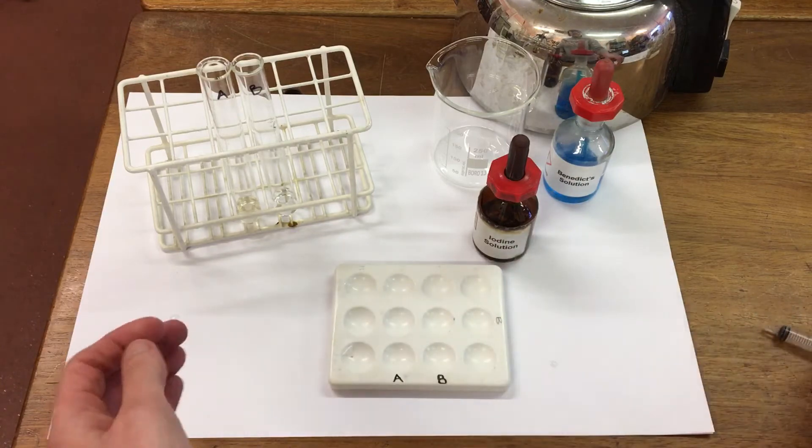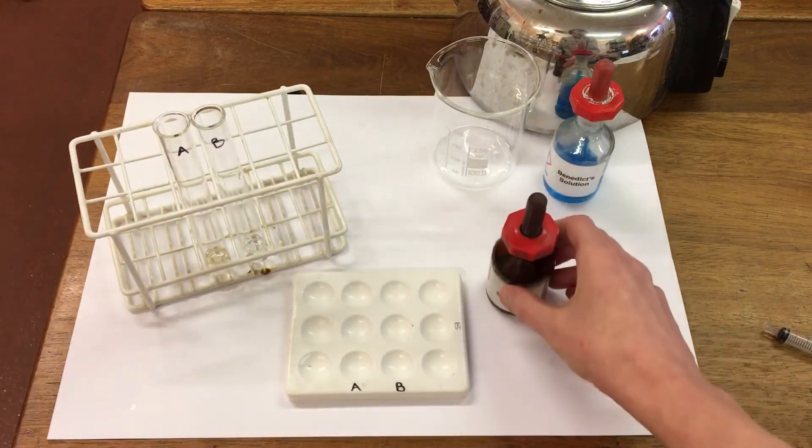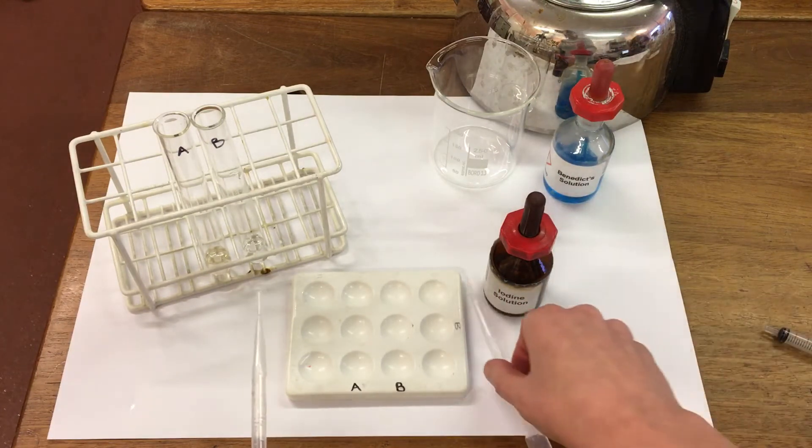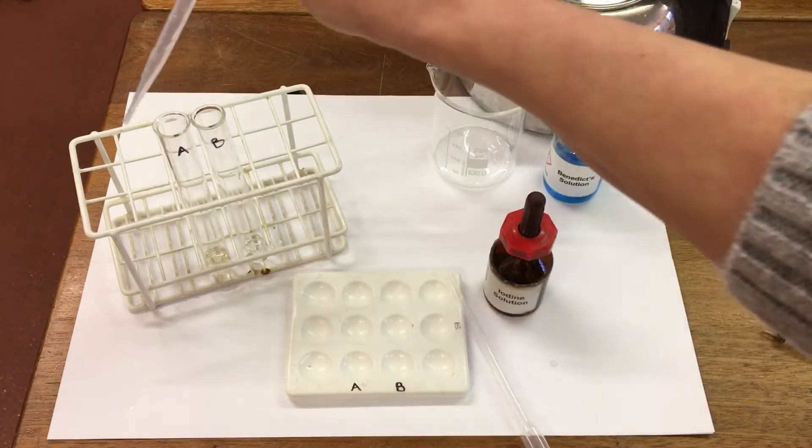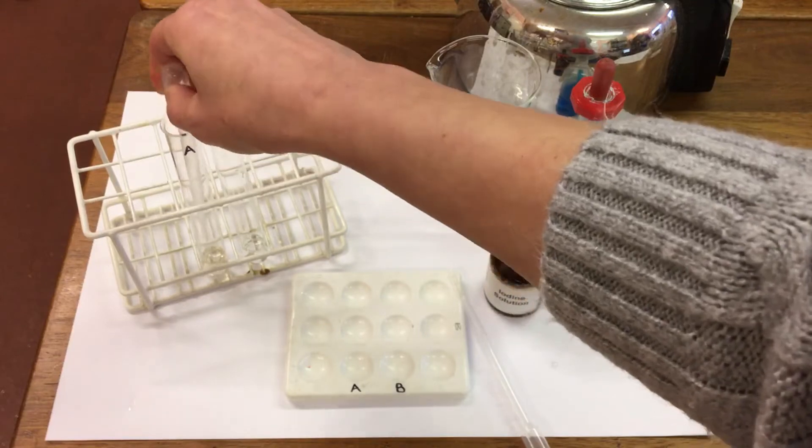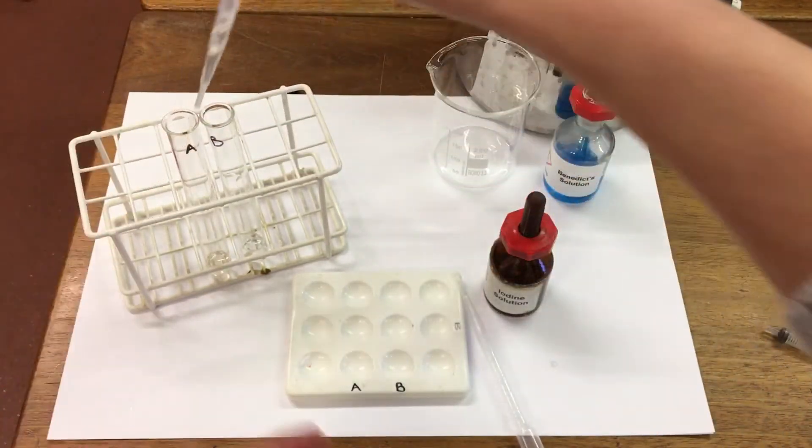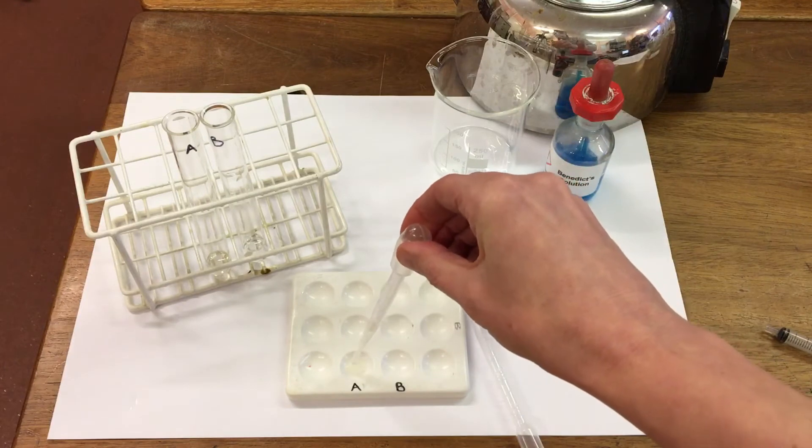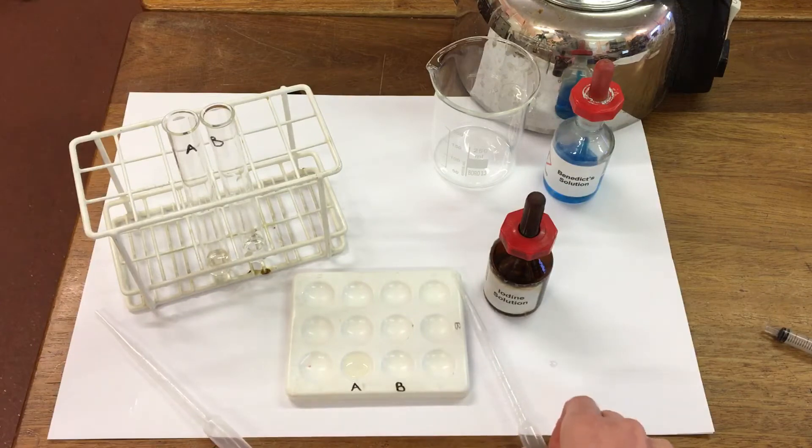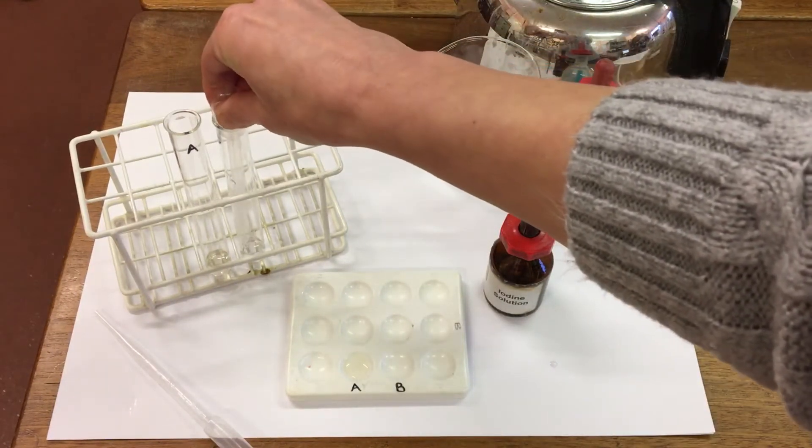First, I'm going to test for the presence of starch using iodine. I'm going to take a couple of drops from test tube A and a couple of drops from test tube B.